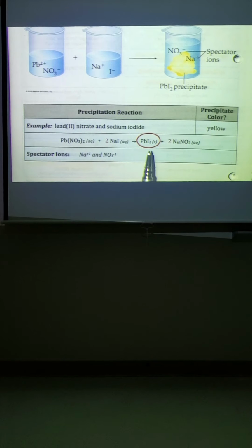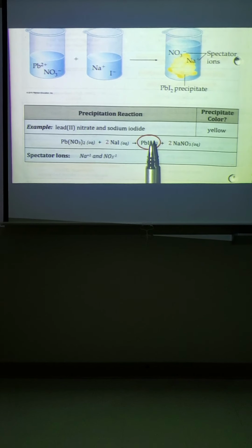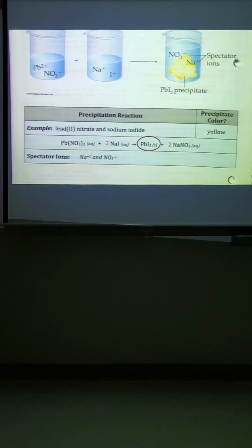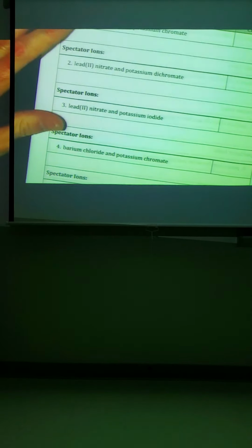that we're going to list below. As we do this lab, we're going to see precipitate colors, and we're going to fill that out as we show and demonstrate that. But we're going to circle who's producing that color in some of that busy work. So let's try some busy work together real quick. We'll give you a chance to get that done, and then you'll be able to pause the video and then eventually get to more examples of what they actually look like.